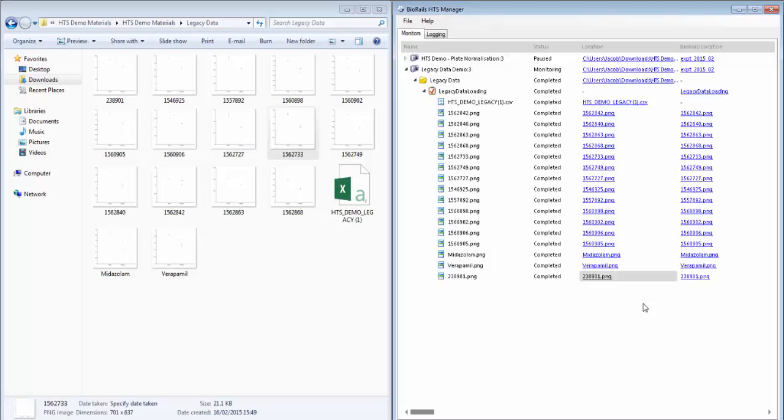Now that HTS has finished uploading those data files, we can see that it's found the data file, all of the associated charts, and has uploaded these all to BioRails.